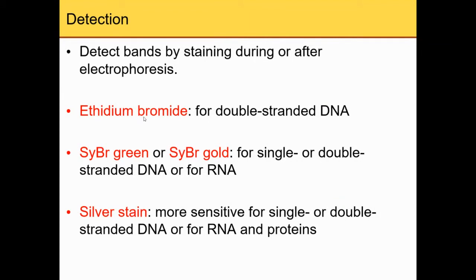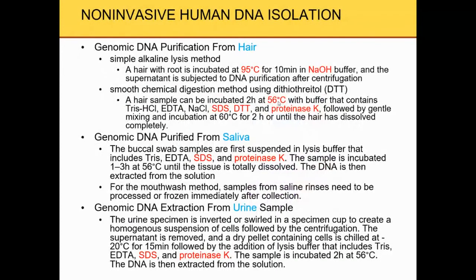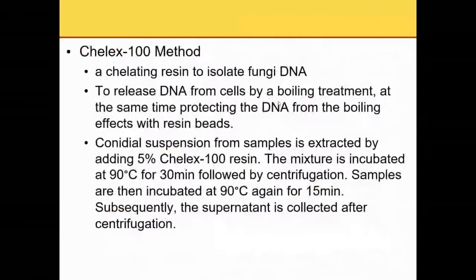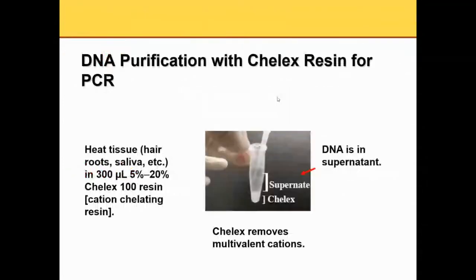And then I mentioned that the convenient way is to use ethidium bromide, right? So that you can see the DNA fragment in the presence of the UV light. And then for DNA extraction, okay, DNA extraction.